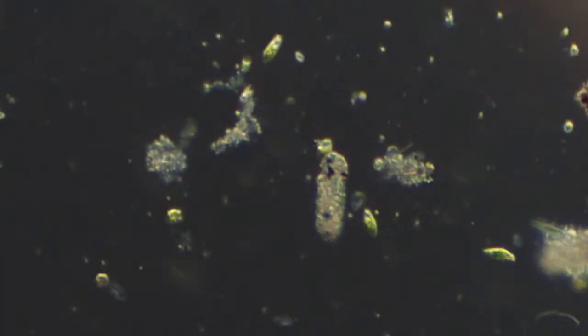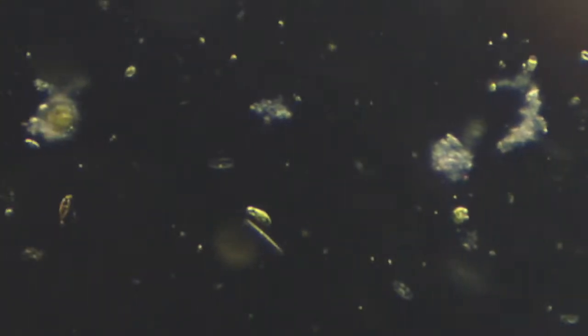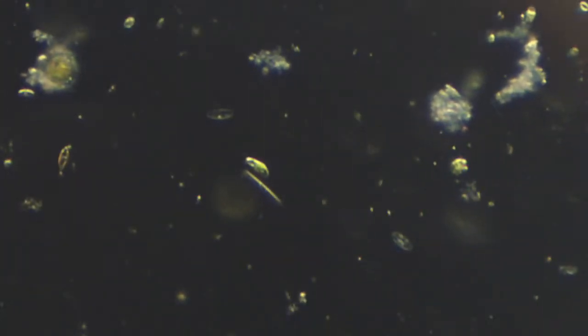Get the hand out of there, that's messing things up. Let's go a little more digital zoom, I think it will handle it. So yeah, a whole bunch of Euglena cruising around in here amongst the debris. Here, a few just chilling out so I can get a little closer to them. Let's try bumping it and see what I get.